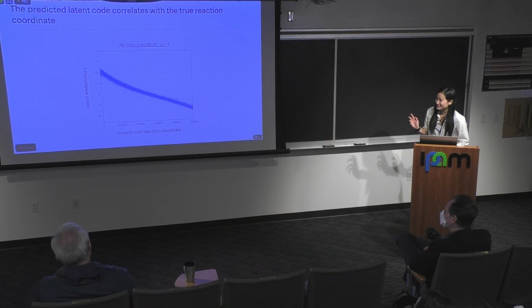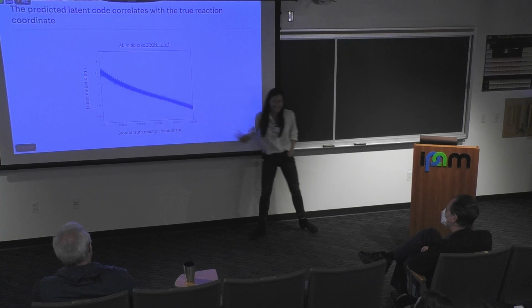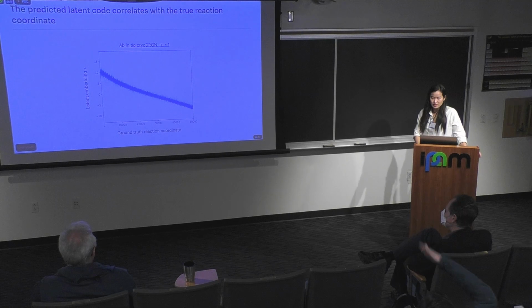So these are the results. Why isn't the ground truth stepwise? Or am I just ordering it along 50,000 images? So the ground truth technically is that each 1,000 image chunk is a separate model, but for the sake of this plot, I'm just showing all 50,000 embeddings.